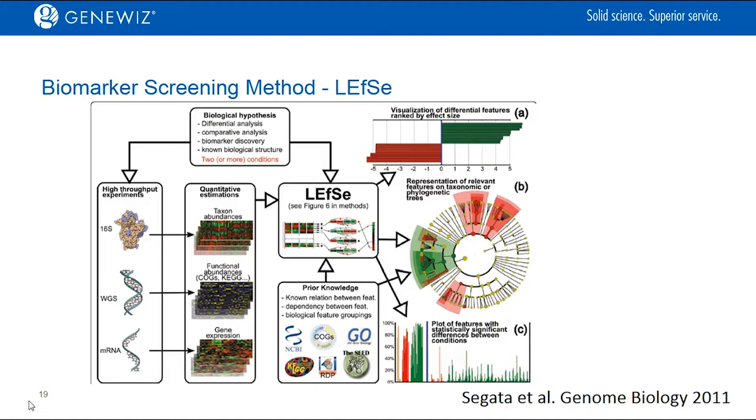Of course, you can see that metagenomic taxonomy and functional analysis has been performed. Then we're going to distinguish the differential features using LEFSE. The method employs a method called linear discriminant analysis for high-dimensional class comparisons, which is tuned perfectly for metagenomics, where often there are more potential biomarkers than samples themselves.